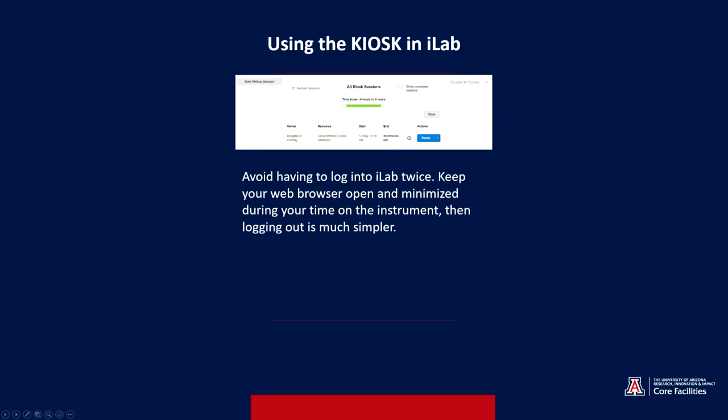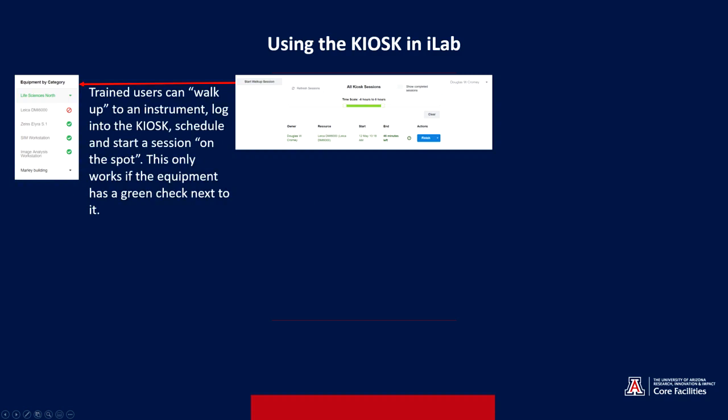When you sit down at an instrument to use it, the browser should take you to the iLab kiosk. You log in with your regular login credentials. You can tell it to start your session. This is another screen. One thing to remember is that you want to keep your browser open, and maybe minimized, during the time that you're working with the instrument or the computer workstation. It just makes logging out a whole lot simpler to not have to log in twice.